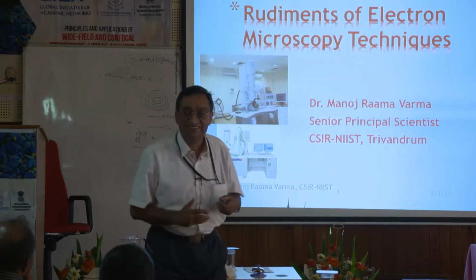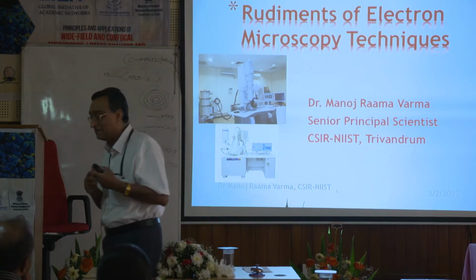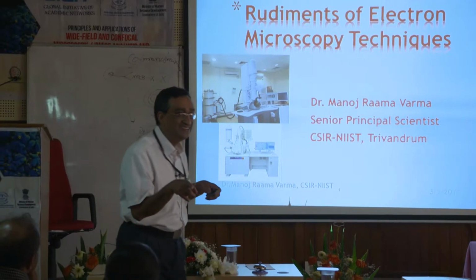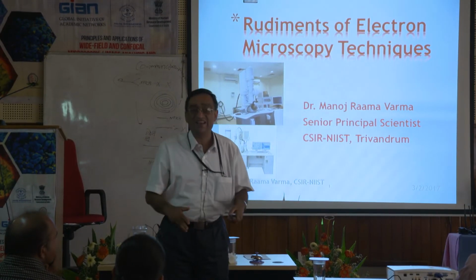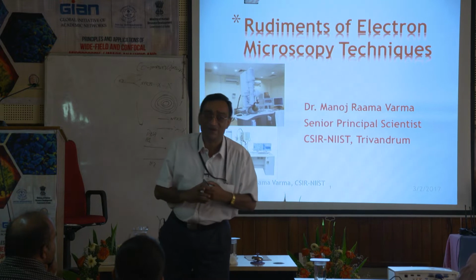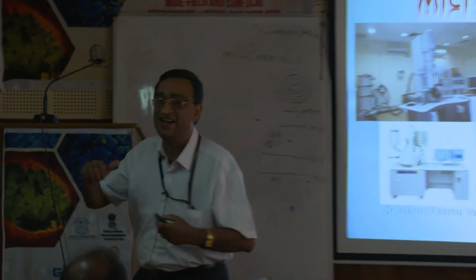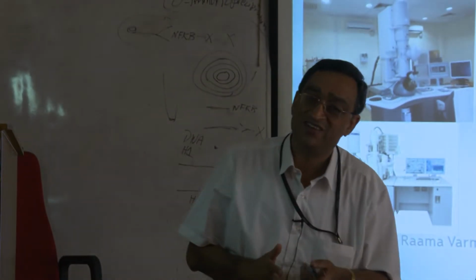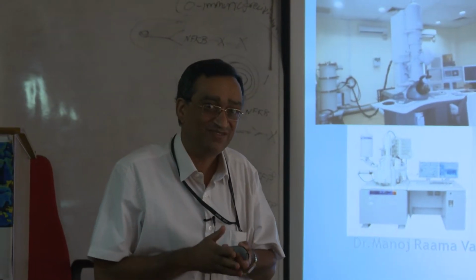I'm basically a physicist, and I mainly worry about how a microscope works rather than what I see in a microscope. Definitely what I see is important, but rather than that, we will see how the microscope works and why this equipment is called a microscope itself.